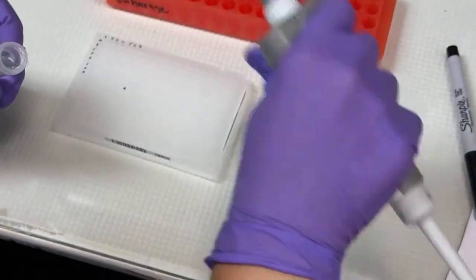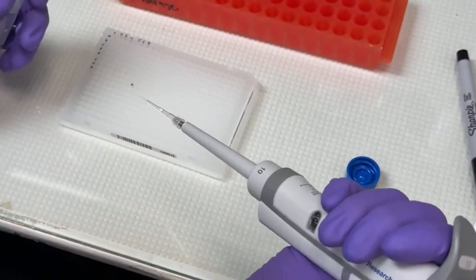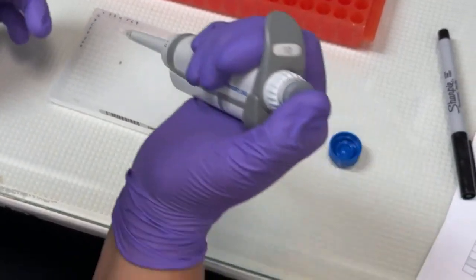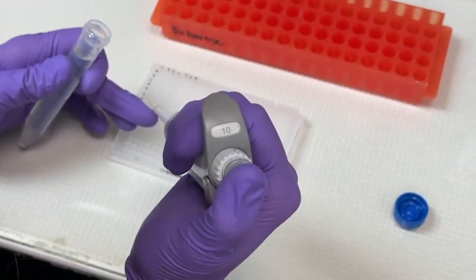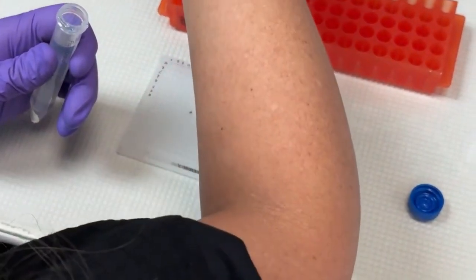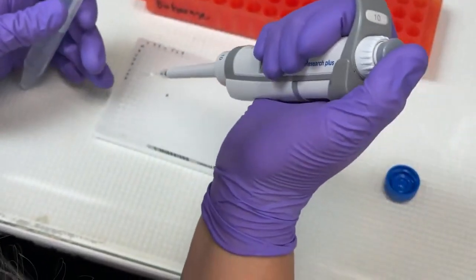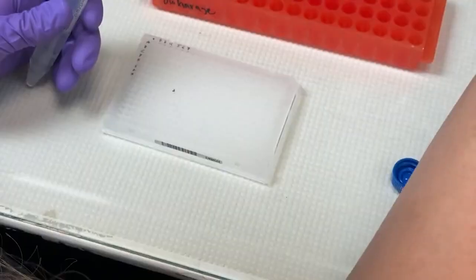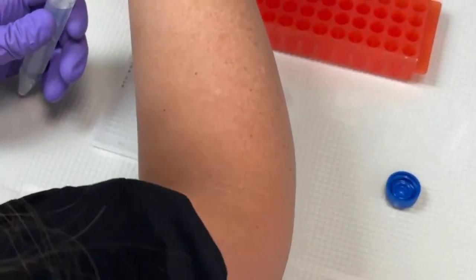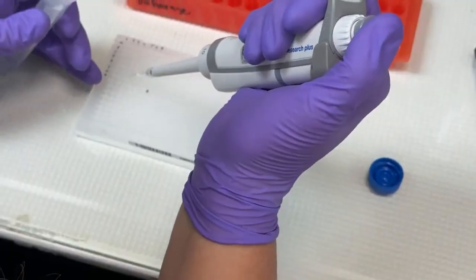We'll talk later. So now I'm preparing my no template control. So what is the purpose of a no template control? It is to assess how your process is viewed without template present. So if your assay is not performing well, you can see extra amplification in those no template controls.